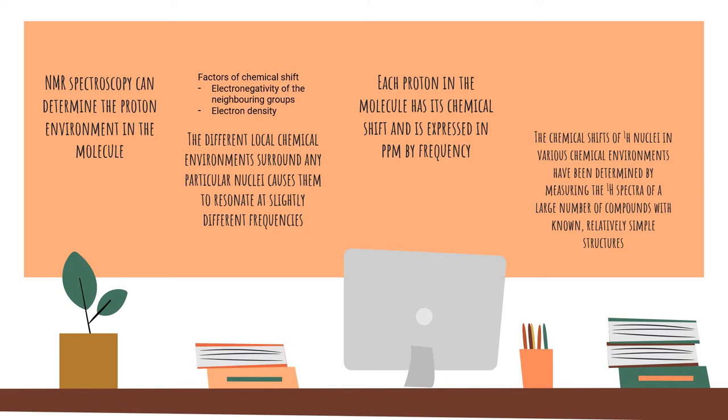The chemical shifts of proton nuclei in various chemical environments have been determined by measuring the proton spectra of a large number of compounds with relatively simple structures. So, Alia Natasha will explain more on how NMR spectroscopy works.